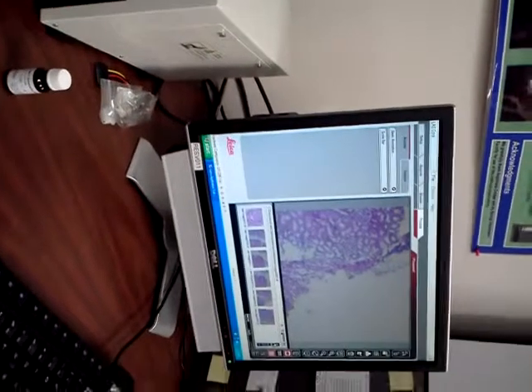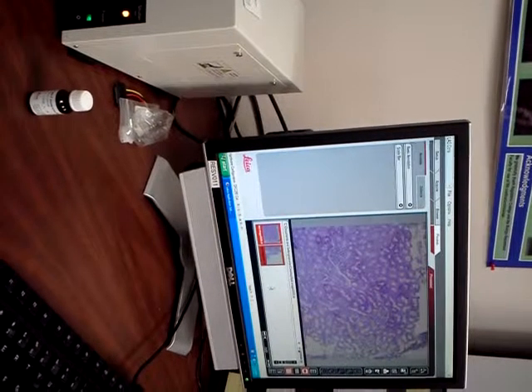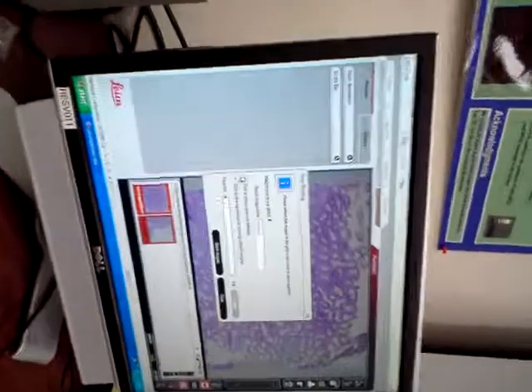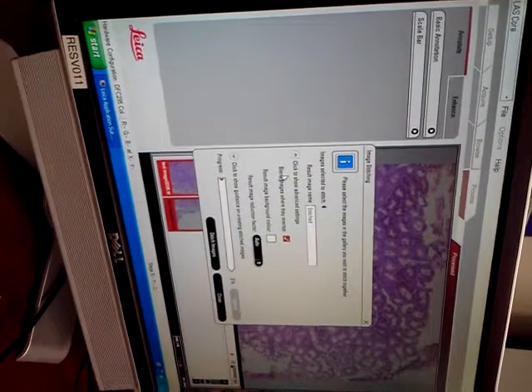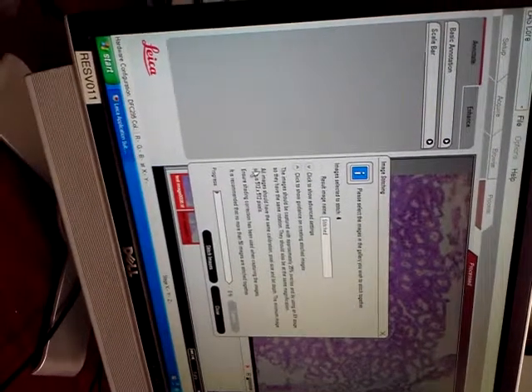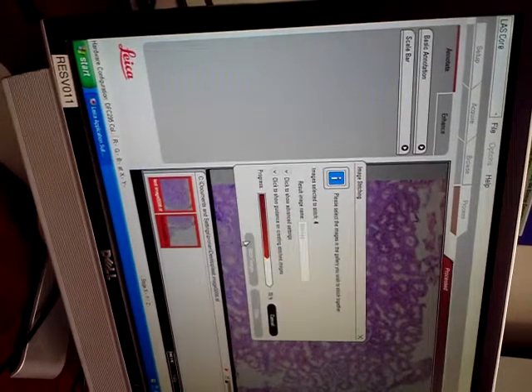I've got to click on the ones that I just captured. So holding down control, 1, 2, 3, 4, stitch. It says 4 images are going to be stitched. And it even kind of tells you what to do. So you want the software to blend the images where they overlap. And here's kind of the guide on how to do it. Capture it with a quarter overlap and make sure they're all captured at the same magnification. Okay, and then we'll stitch the images together.